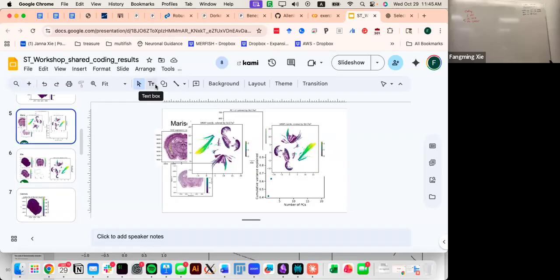Let me interrupt it and then run it again. Hopefully it runs through in seconds. Ah, yeah, it does run through in 7 seconds.